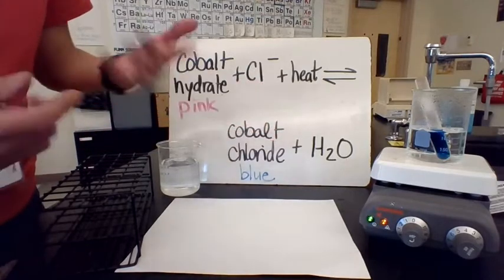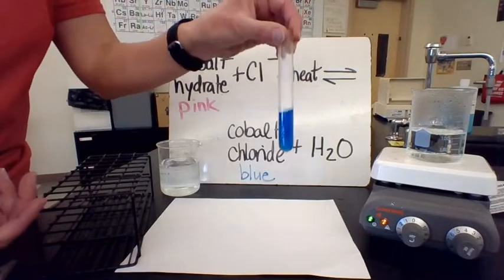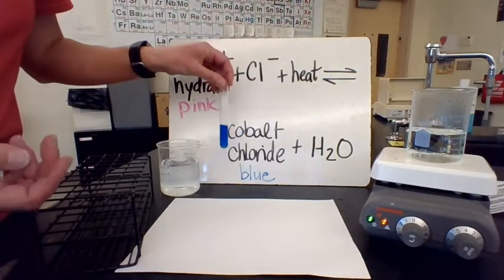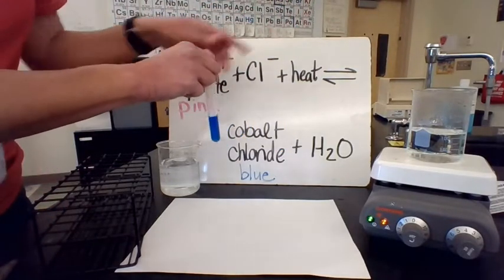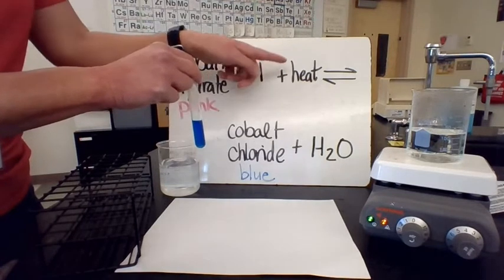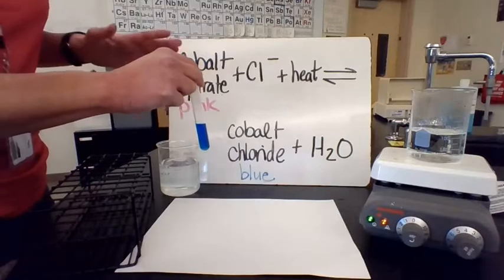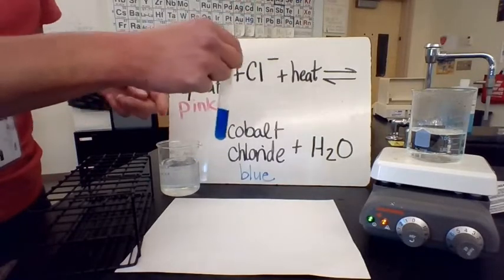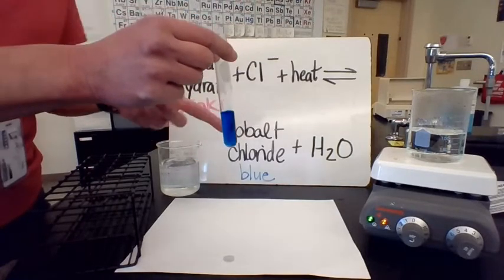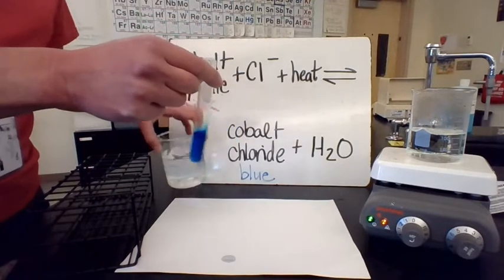We can't tell it's making water because there's a bunch of water there, but look at this. Have you observed this color change? Wow, now it turned blue. So when we added heat, the reaction shifted to form more products, to use up that excess heat reactant and form products, okay? It makes that forward endothermic reaction maybe more favorable, and so we end up making more of this product right here.